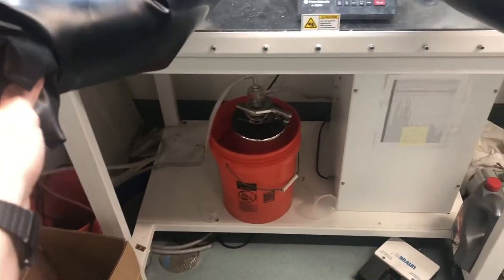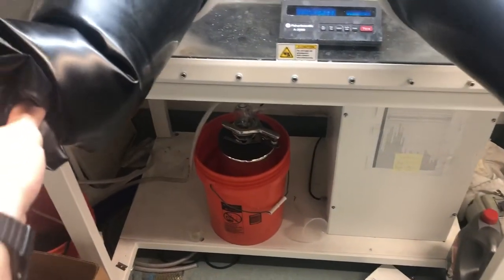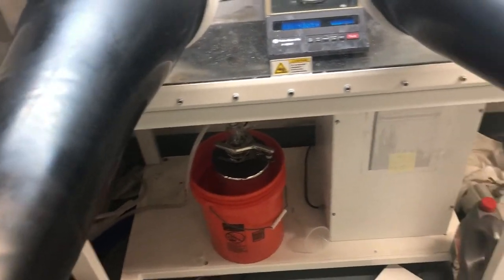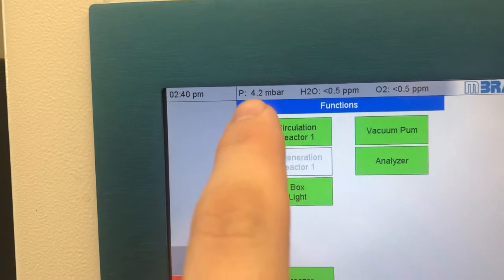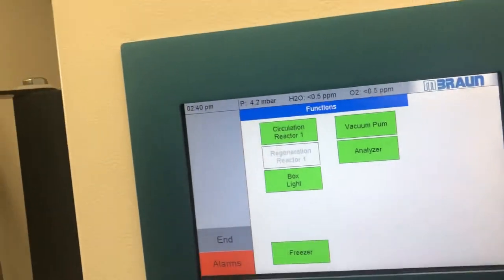As you reach in, you can hear that this is pulling vacuum. It's pulling vacuum because this thing is being told to stabilize below 5, below 5 millibar and above 2.5.